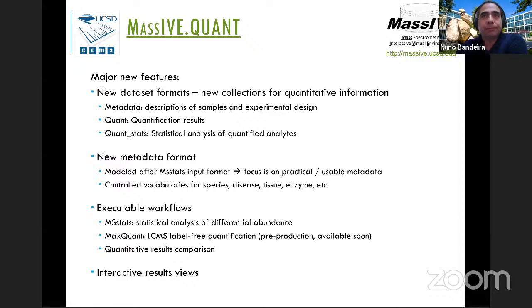The other question is, is it possible to retrieve a large set of proteins and peptides to generate a spectral library with MassIVE tools? If so, are there limitations? Let me see, there are two different ways to answer this. The first one being, if we're talking about human, we already have a spectral library that covers a lot of the data that is available out there. I mentioned earlier in the talk that it was 2 million precursors. It has actually been expanded recently, and it's now almost at 4 million precursors. So for human, we have a pretty comprehensive spectral library already in place.